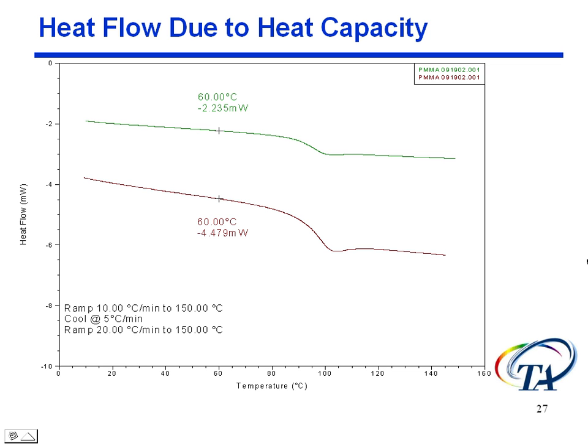And this is just to remind you of the example of the PMMA, where if we heated at 10 degrees a minute, heated at 20 degrees a minute, heated at 10 degrees a minute, heated at 20 degrees a minute, heated at 10 degrees a minute, and if we set that up in just a sinusoidal consistent modulation, we would see that data in between there.